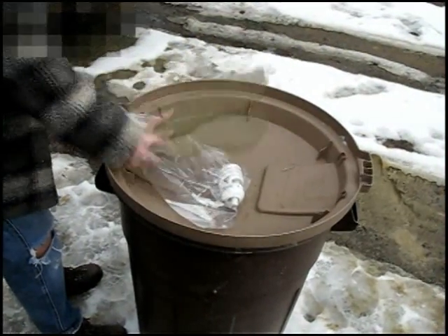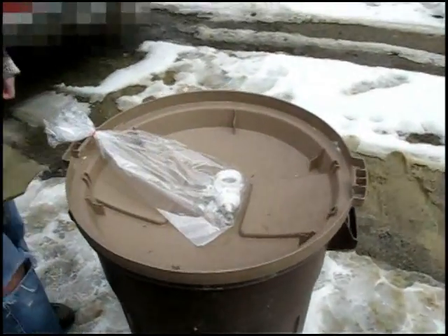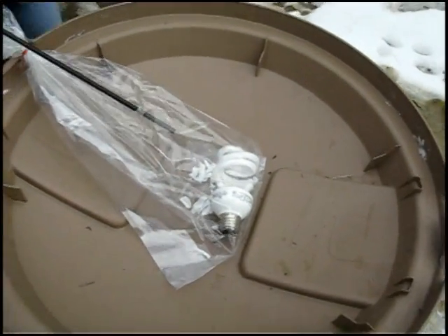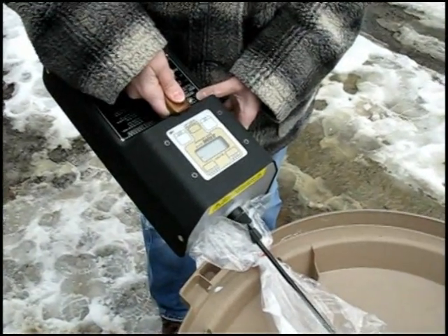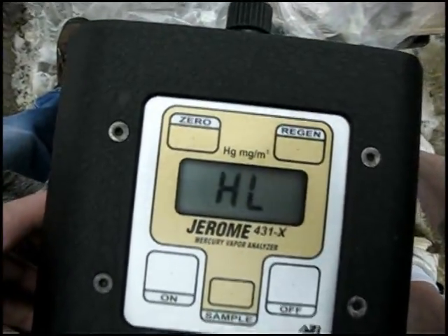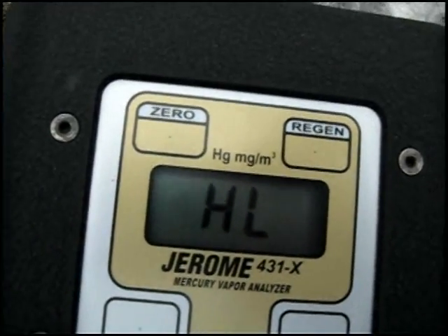Moving along, we broke the compact fluorescent bulb inside the bag just as we had done with the previous bulbs. We then took our first reading. The mercury level was so high the meter was unable to read it. Again, the mercury vapor levels were too high to read.